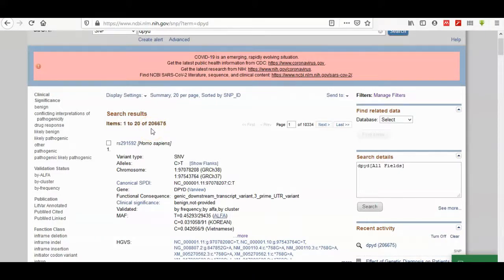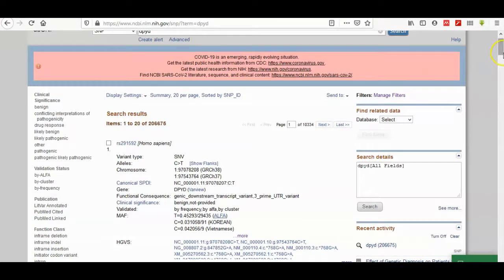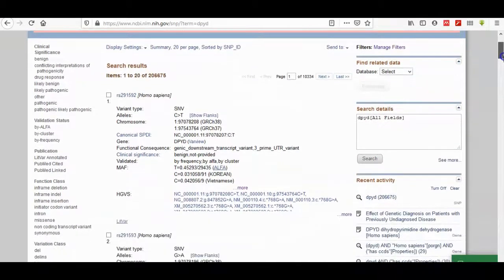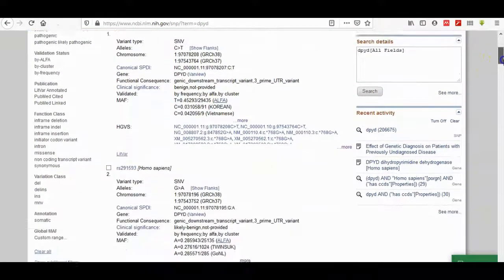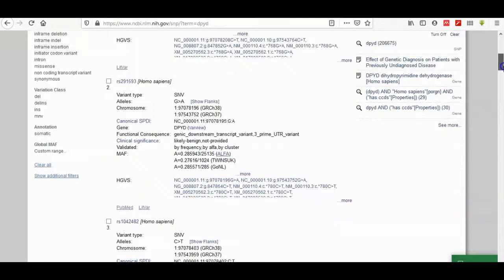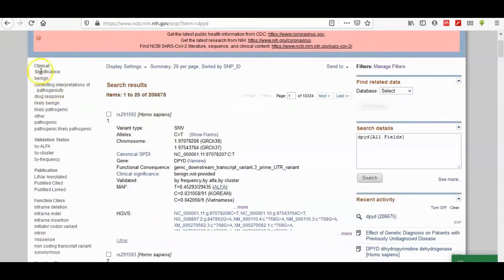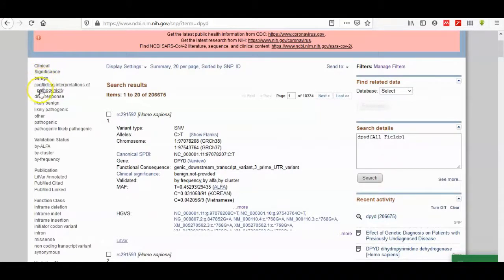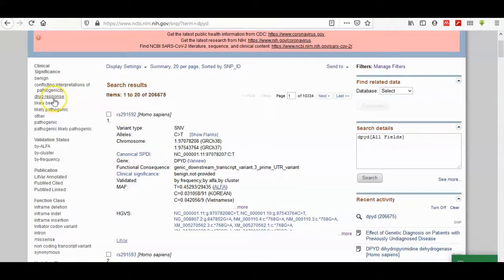It's impossible for you to detect which is useful in your research, so the clinical importance of the SNPs is valuable. You can filter your SNPs from here - significance, benign, conflict, interpretation of pathogenicity, drug response, SNPs that interfere with drug response, unlikely benign, likely pathogenic, other, pathogenic.